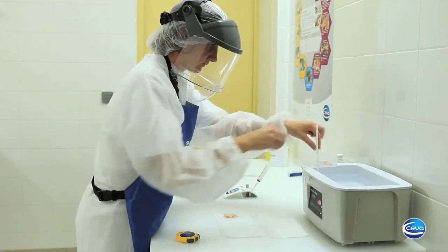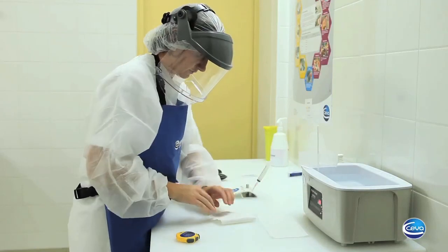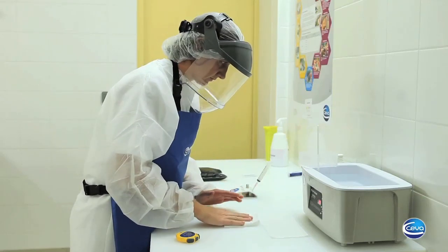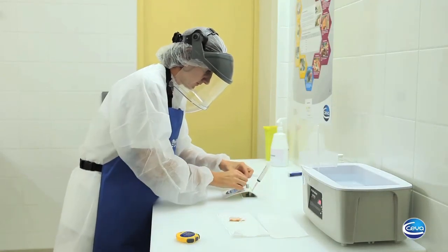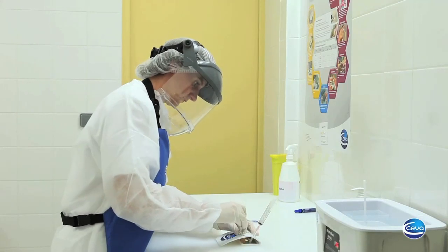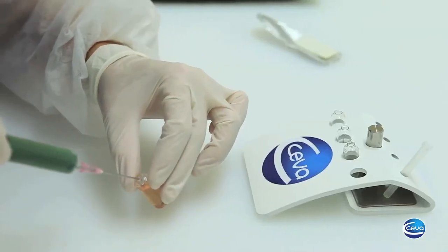Remove the ampules from the thaw bath and dry them with a good quality paper towel. It is good practice to remove vaccine from the upper part by flicking the head of the ampule smoothly with your finger. Gently open the ampule with the ampule opener and remove it with the diluent-filled syringe. Make sure you remove all the vaccine from the ampule.